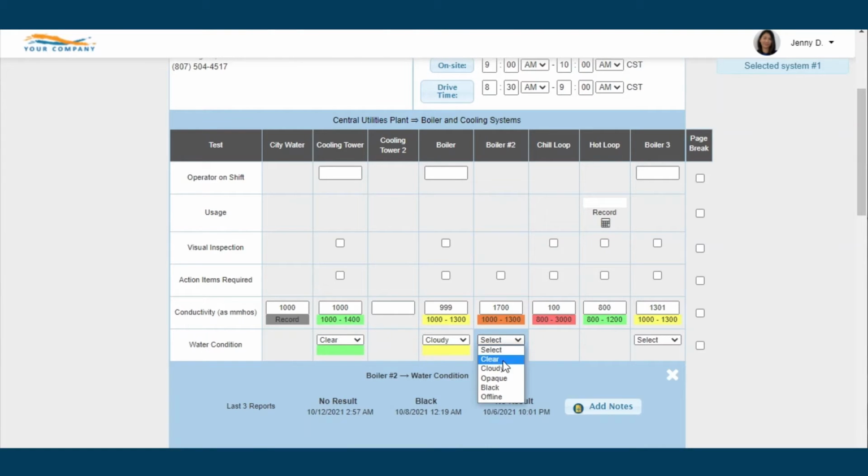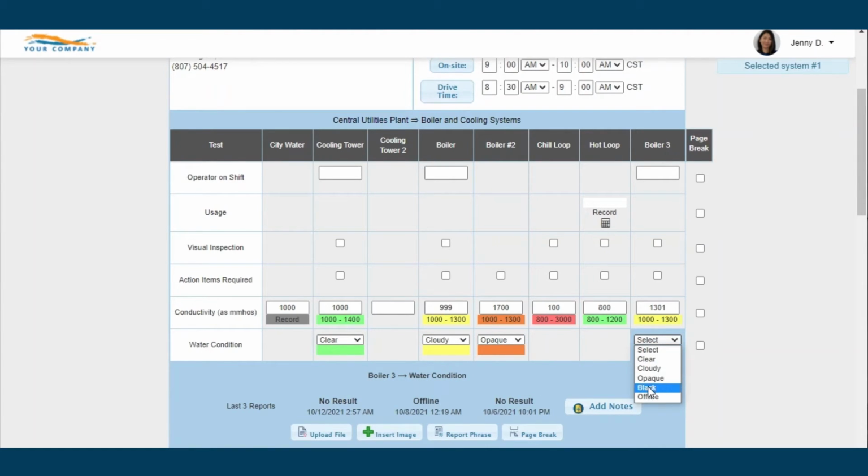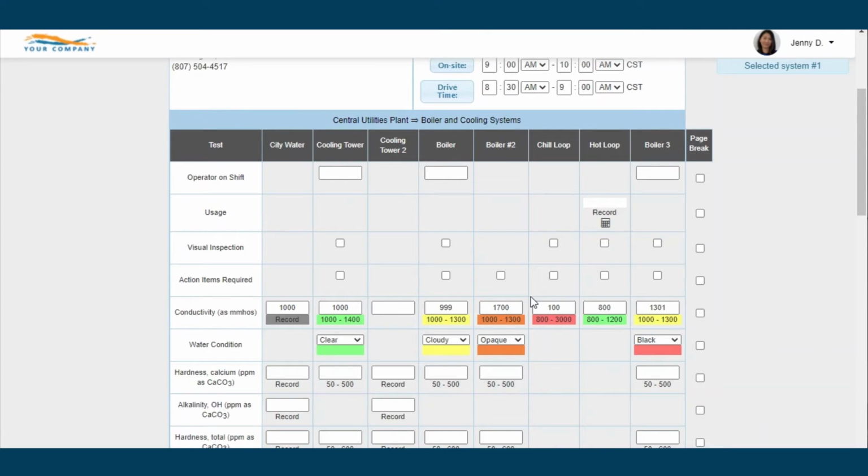Binary and list control ranges will appear as a drop-down selection. The checkbox control range can be checked or unchecked as needed.